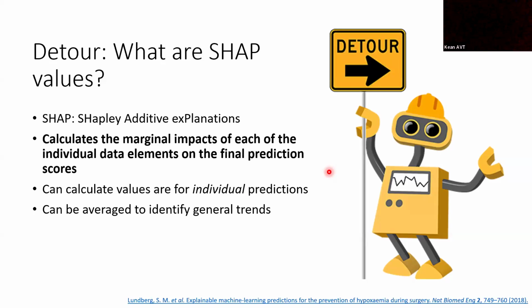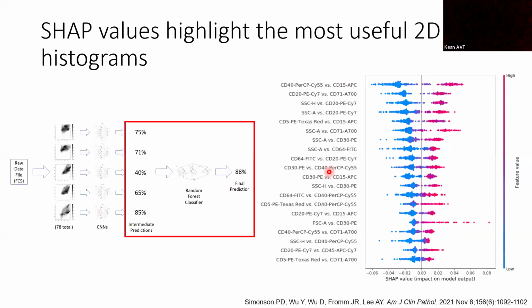For the values where a small tweak changes it a lot, that is determined to be a very impactful data point. So we can map back to the important parts of the data for the individual predictions. And it's nice because we can do it not only for the general picture, but for individual cases, one case versus another.